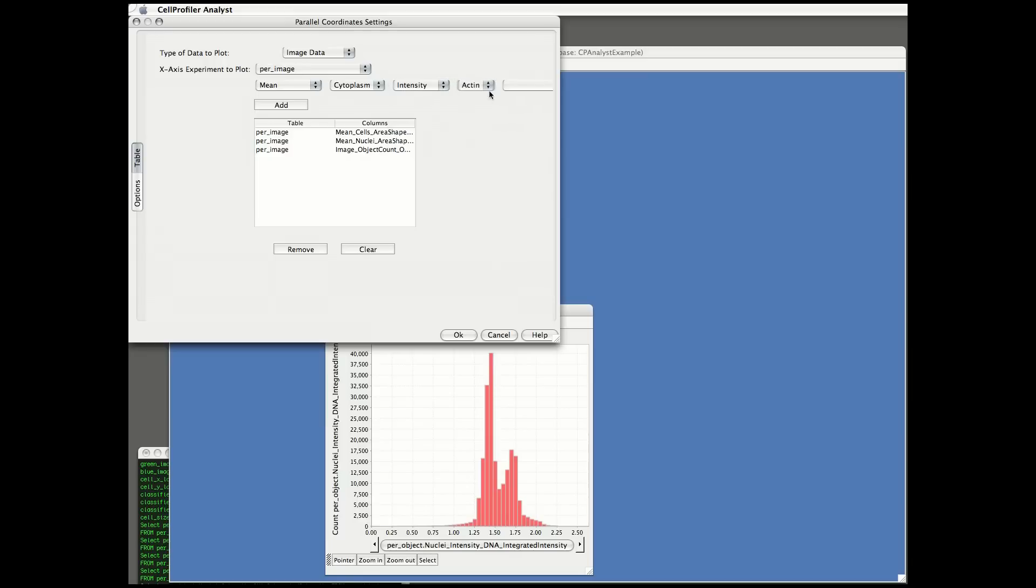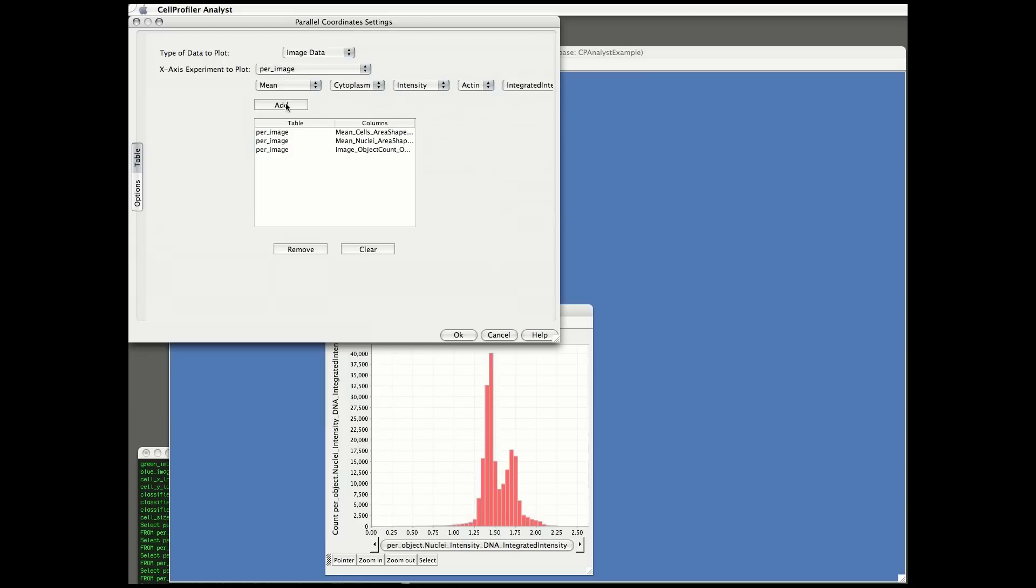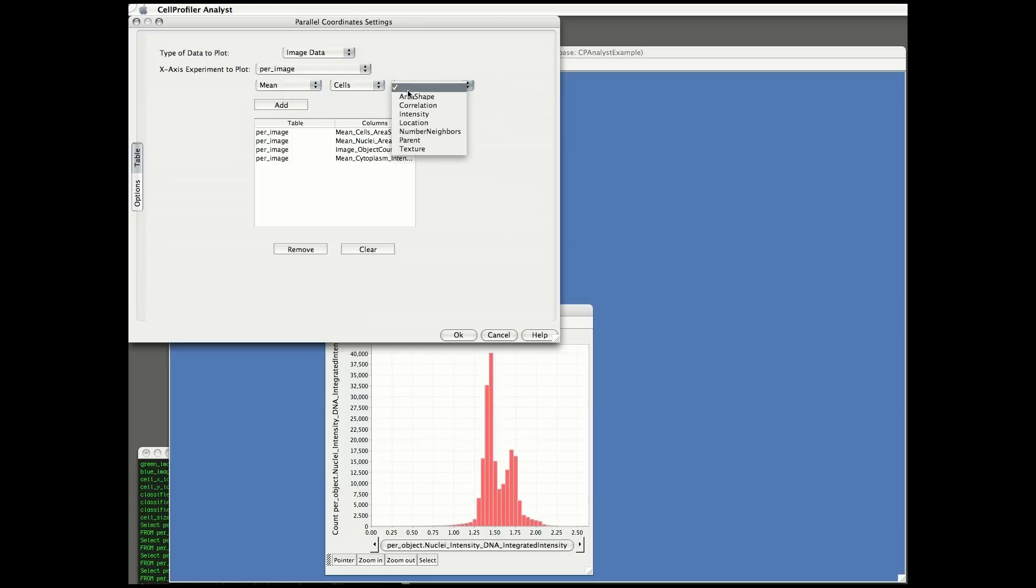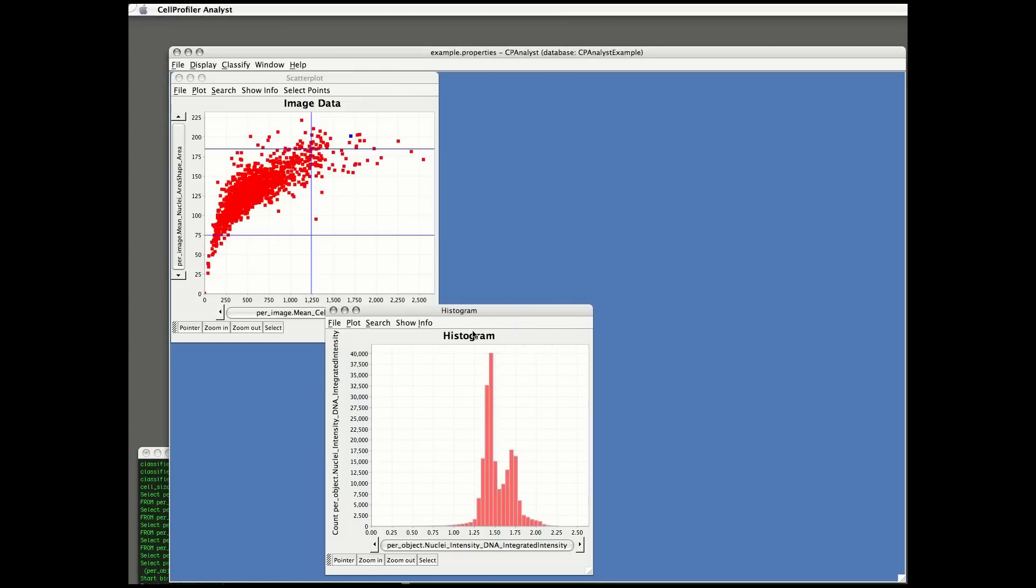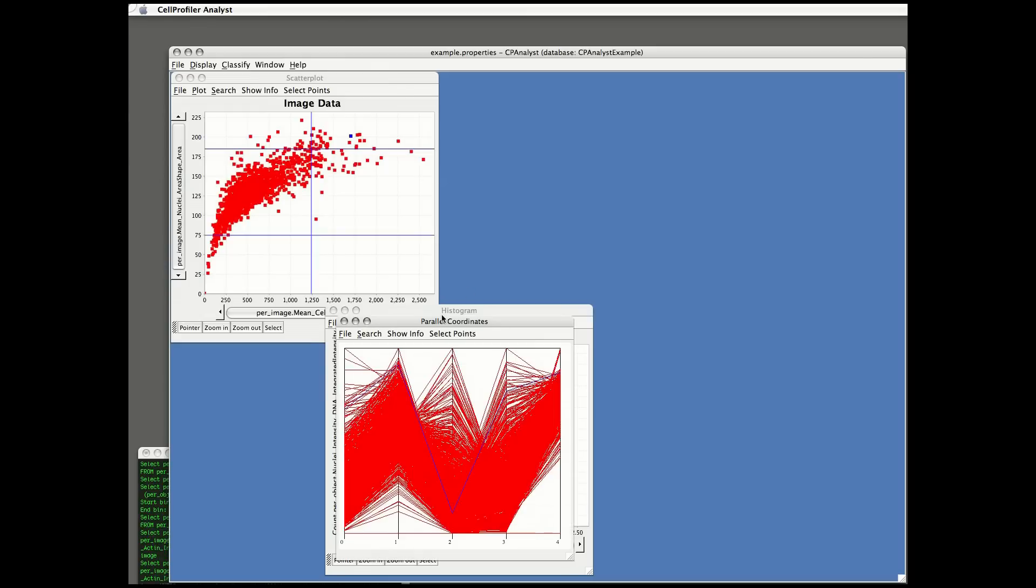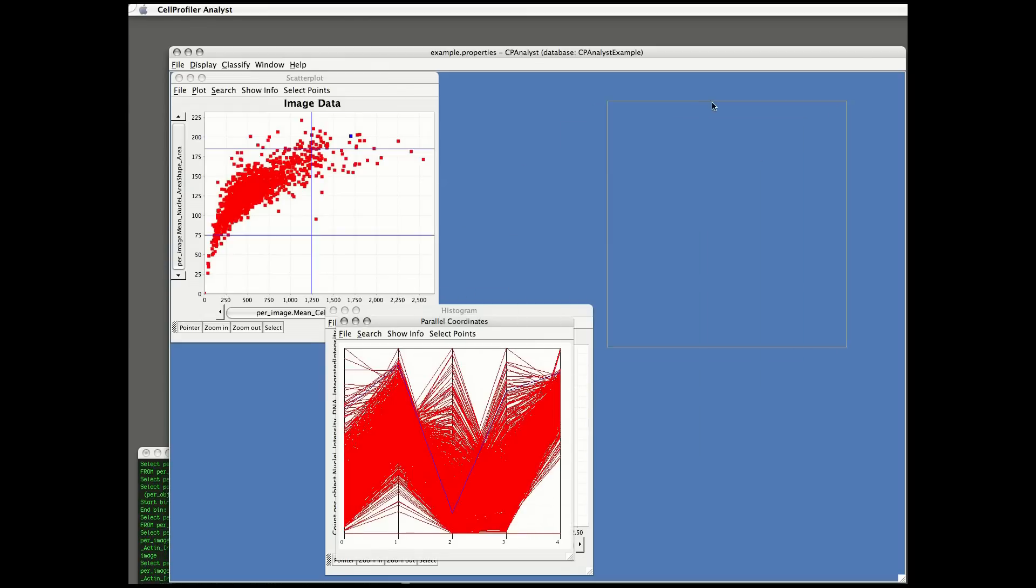Notice how the one blue point that I've selected in the original scatter plot is also going to appear blue in the parallel coordinates plot once I've created it. So I've got five coordinates here that are appearing in the parallel coordinates plot, and you can see that one blue line is representing the one blue point in the scatter plot.